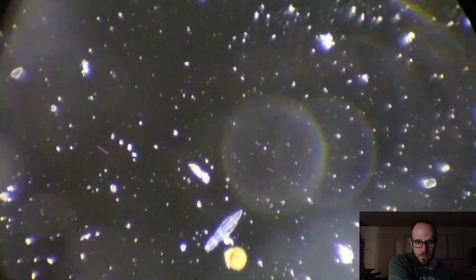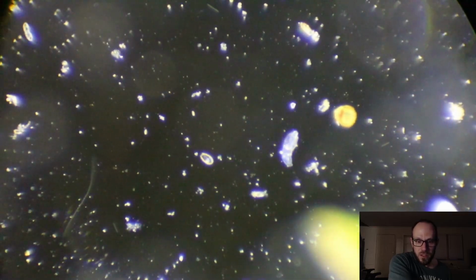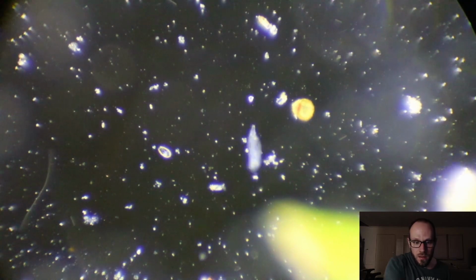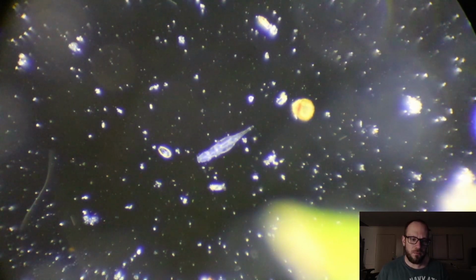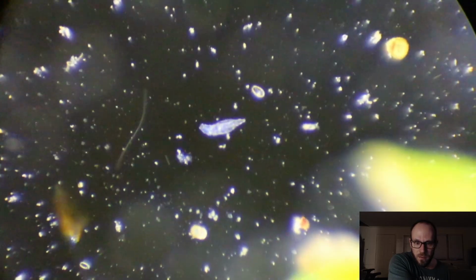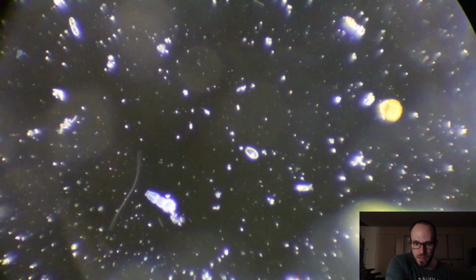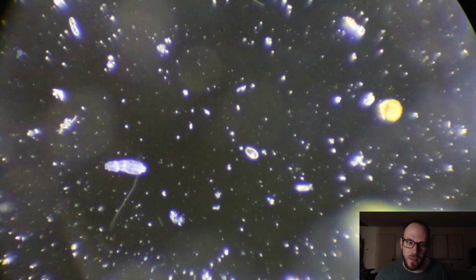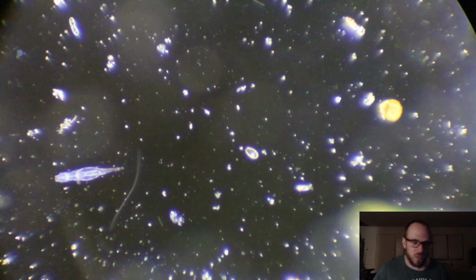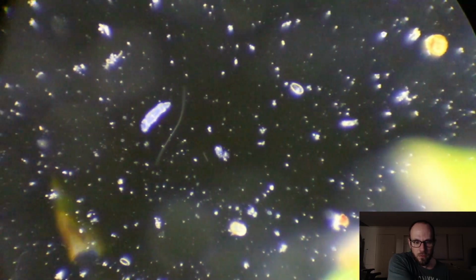Finally. And he just be chilling. We'll see if he actually starts trying to eat at all. I'm gonna get dead center on it. This little thing right here, kind of U-shaped with almost a luminescent border. I've seen a bunch of those, but I've never seen them move or do anything. So I don't know if they're alive or if they're eggs or what.